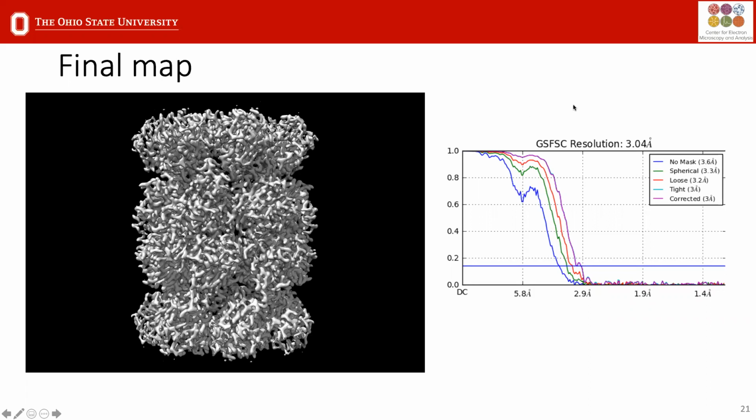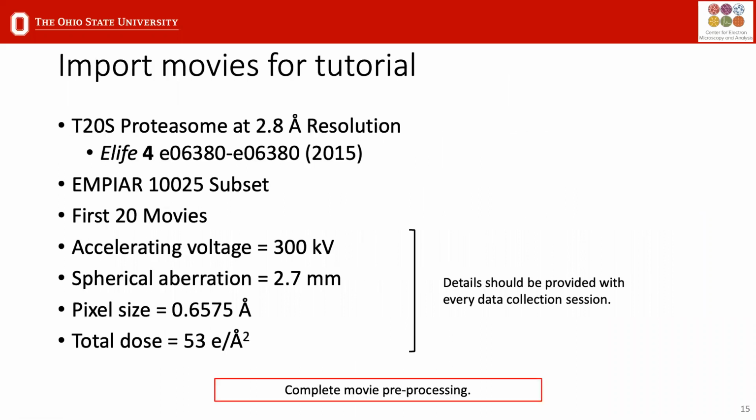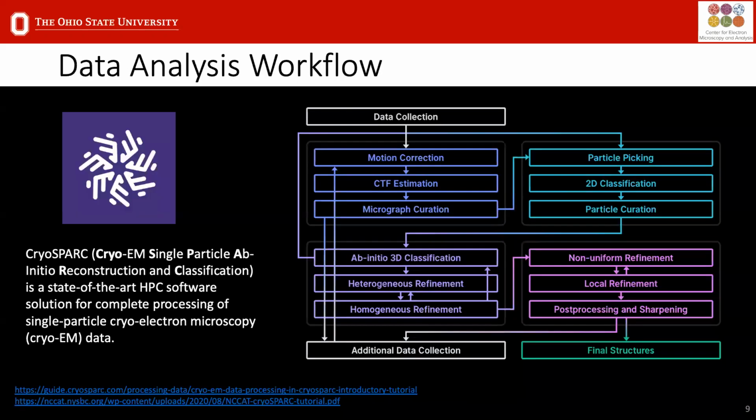I would say sometimes what happens also, I've heard this trend happening, is that people actually, if I go back real quick, sorry. If we go back to the original workflow here, sometimes what people have been doing is actually, once the particles have been picked, you can move straight to making a model. You don't necessarily have to do 2D classification. And as I mentioned, it can be kind of dangerous because you may be throwing away data that's useful. So some people have just gone with these particle picking algorithms, and then they move straight into building the 3D model. That's definitely an option.